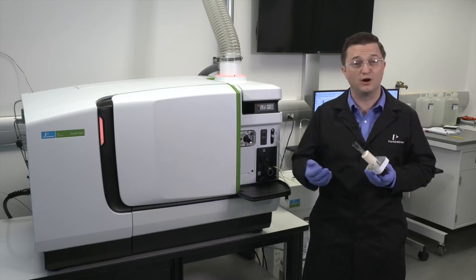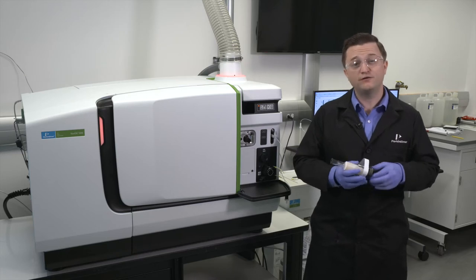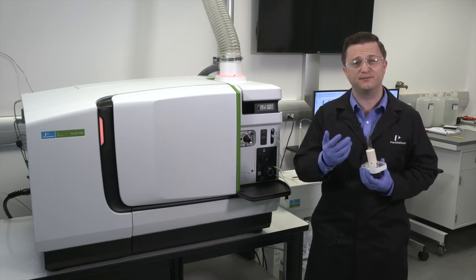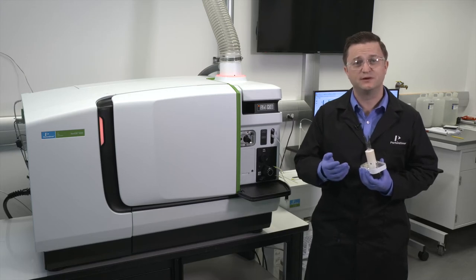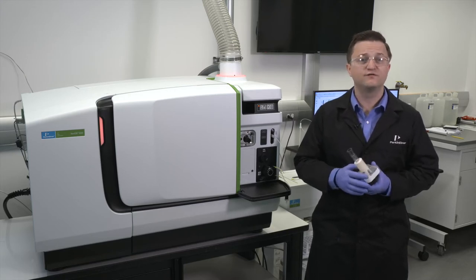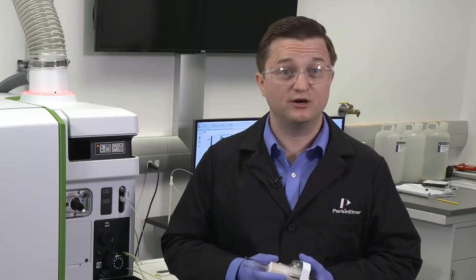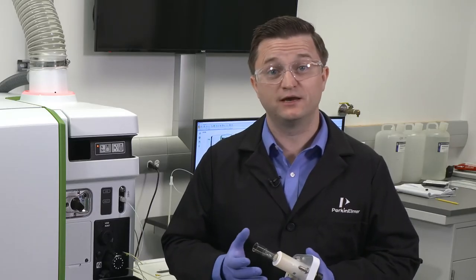No tools are required, but powder-free latex or nitrile gloves must be worn to prevent contamination of the sample introduction system and possible injury from residual sample in the system. Make sure that the spray chamber and nebulizer assembly are out of the way.